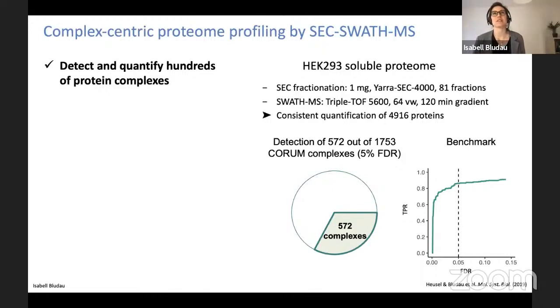Yeah, no, it's a very good question. So generally, we use an FDR threshold on the peptide level for each fraction separately. If the peptide drops out of the selected FDR that we choose, then we consider this peptide absent from this specific fraction. But this being said, we are actually using a fairly loose peptide level FDR threshold, and rather filter on the protein level.